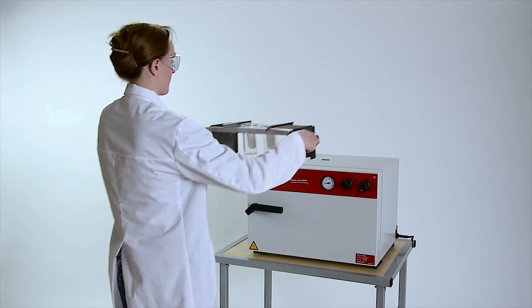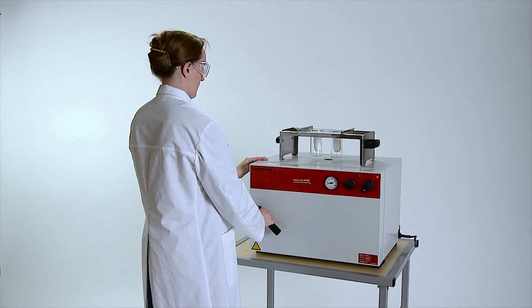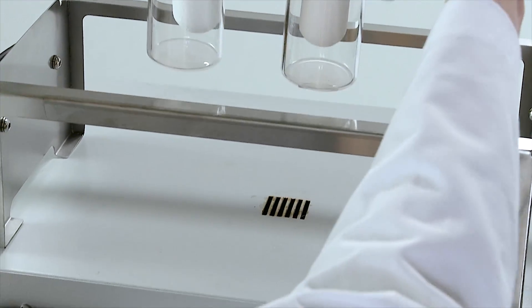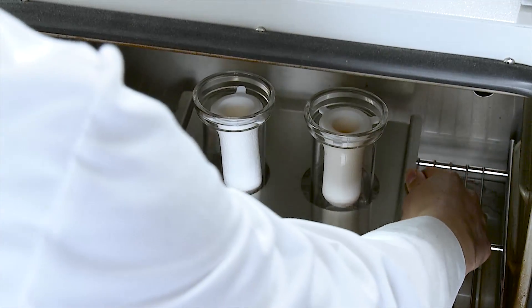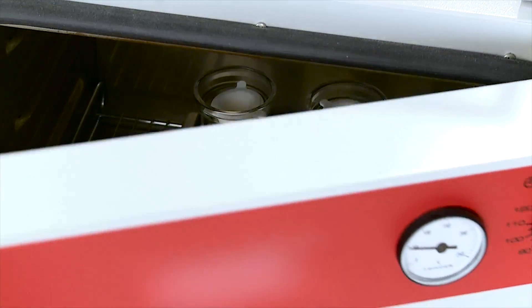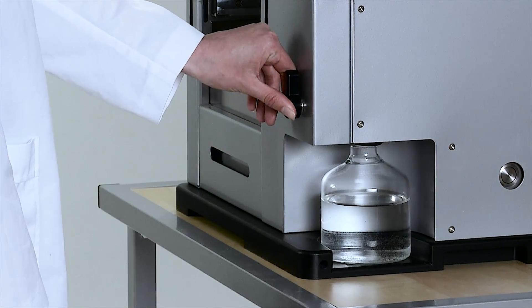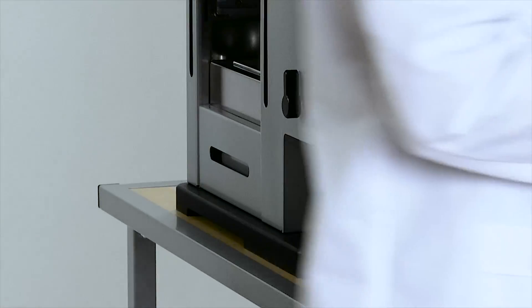In order to ensure that the solvent is removed, the sample should be dried in an oven. The handling of samples is simplified with the Soxrock rack. After drying, the content of the sample can now be measured. It is easy to remove the solvent from the system or to transfer the solvent to an external tank.